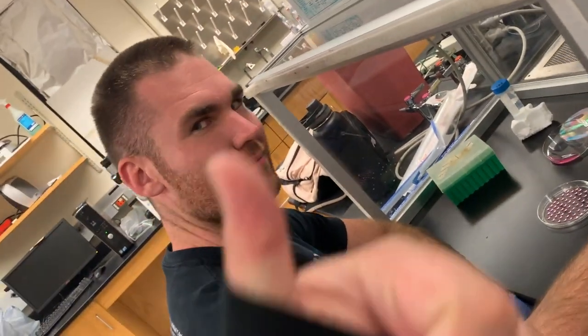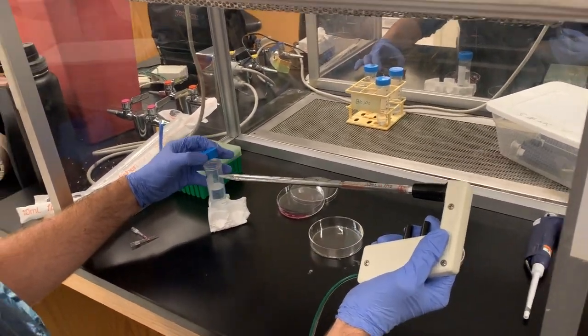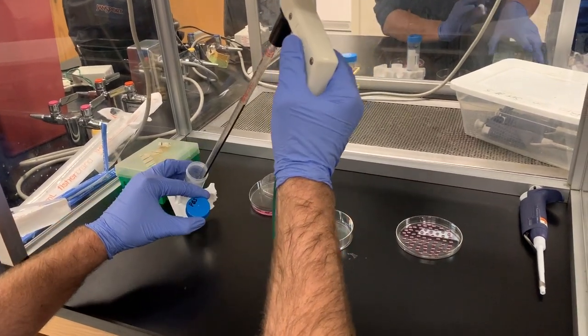Once you have fit as many drops as you can on the lid, add PBS to the bottom portion of the petri dish to assure the drops will not dry out.